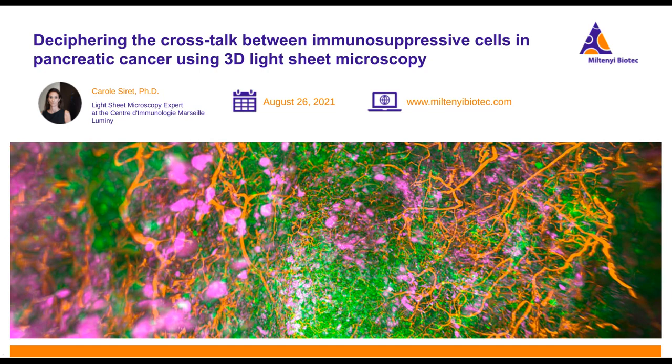Thank you. And we have a question coming in from Ralph. How did you isolate the MDSCs and Tregs? So for the isolation of the cells, we harvest the tumor 3 weeks after the inoculation. We dissect them into little fragments with scissors. And we did the incubation with collagenase type 1. If I remember well, it's 30 minutes at 37 degrees. And after, the suspension is filtered, and we sorted the cells.